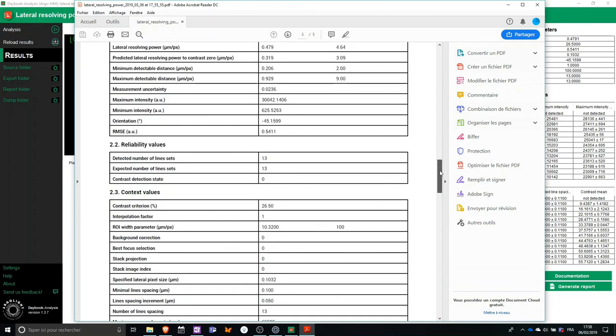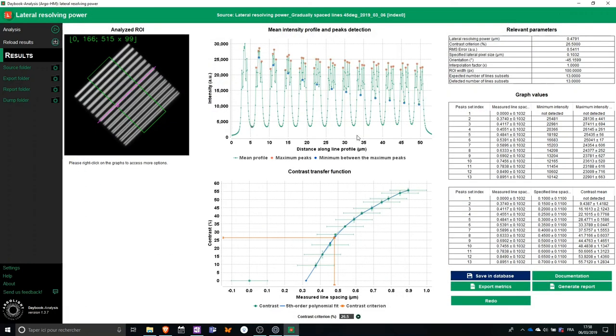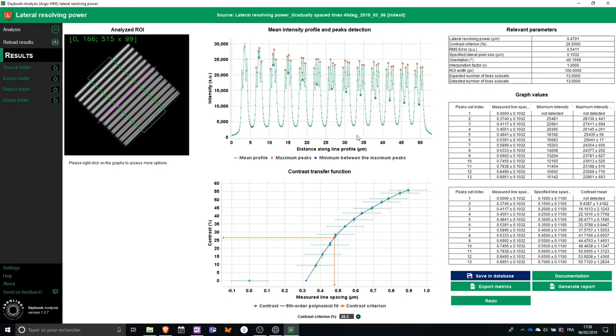Of course, if I want to, I can also try to do some troubleshooting and maybe redo the images and the analysis after cleaning the objective or performing some basic troubleshooting tasks.